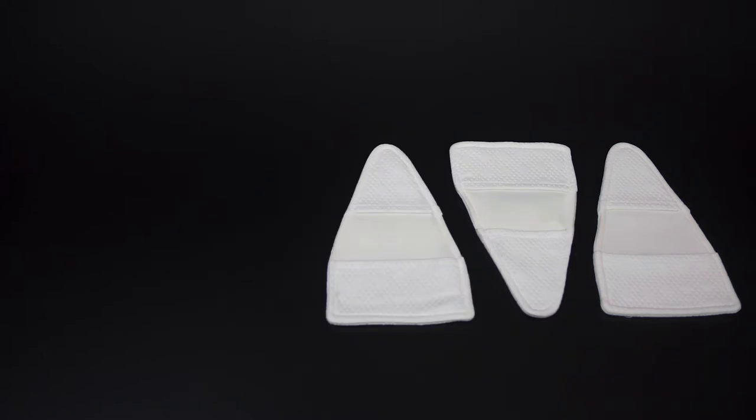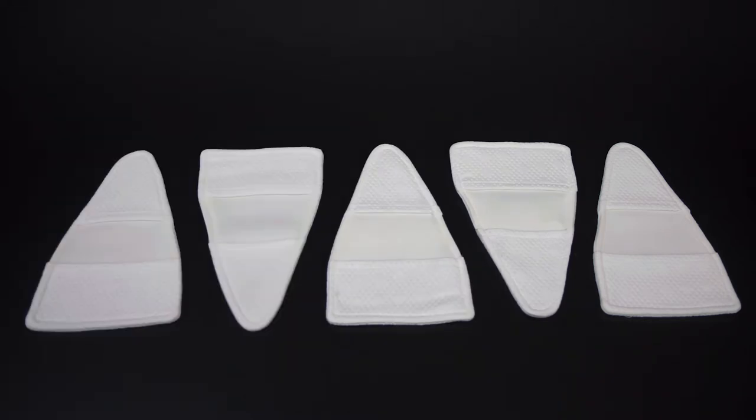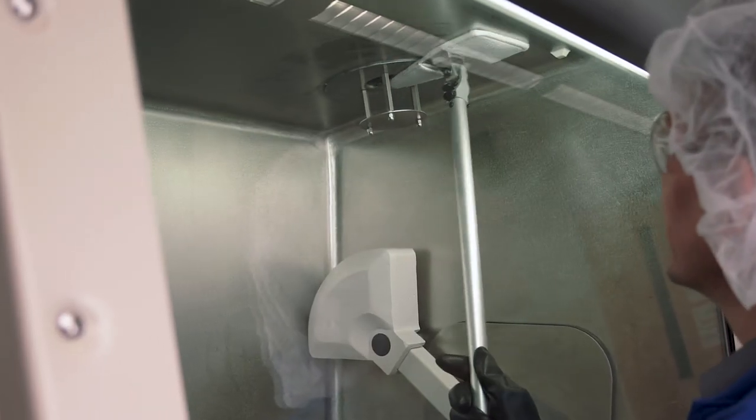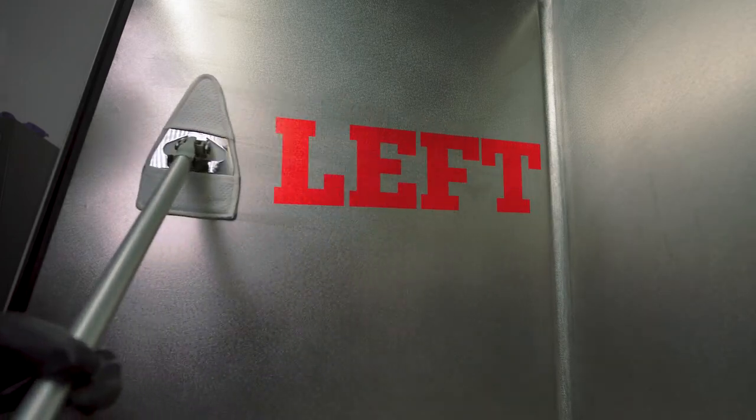Use one padded cover per interior surface, at least five covers, in the following recommended order: ceiling, hooks and rods, back, left, front, right.